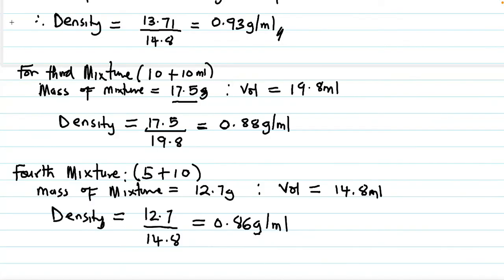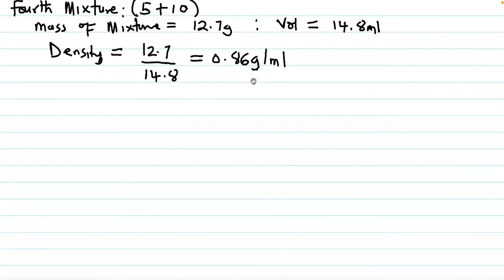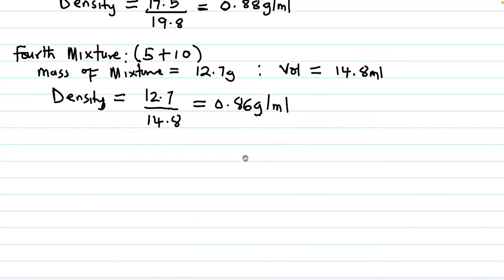Okay, we have the fifth mixture, which is 5 plus 15 mil.